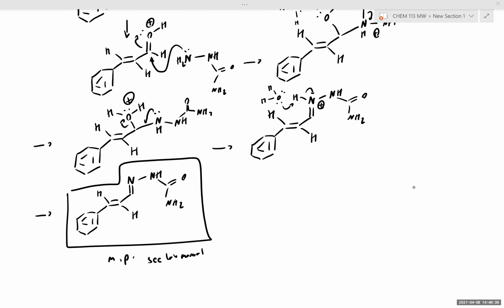The literature mass percent, it's not fixed. It varies depending on the brand of cinnamon and the type of cinnamon. You shouldn't get a particularly large number for the mass percent, that's for sure.